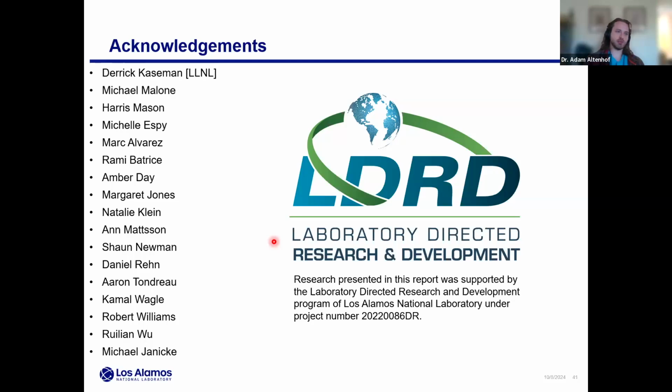Yeah, so it just depends case by case. Ultimately in the NQR I showed, we did happen to have a lot of sample, which is helping the SNR a lot. Also, that long T2 and the CPMG helps, but we're talking about multi-gram scale. We can still measure in less than a minute with that to get just a peak, but it really does take that kind of quantity, without playing any other tricks.